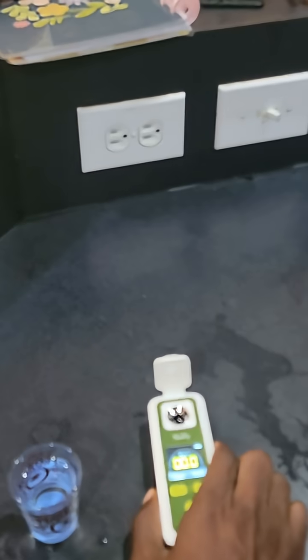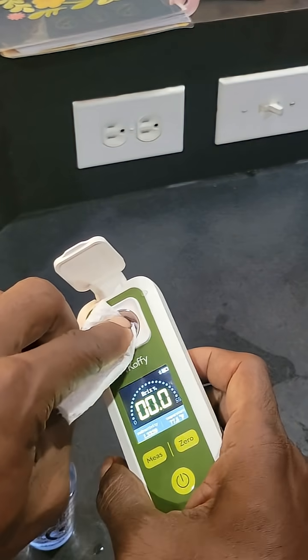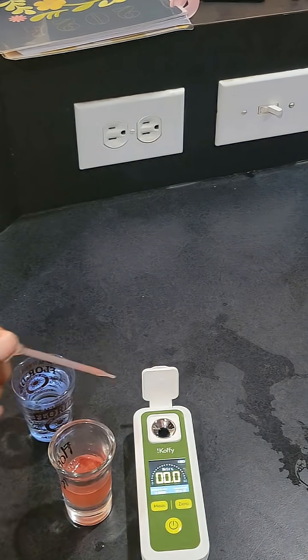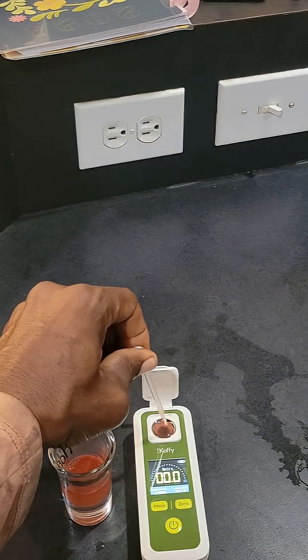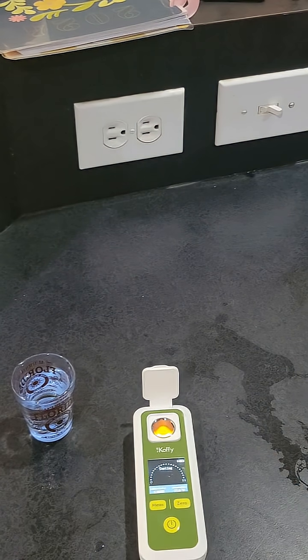Step five: empty the water and make sure you take a paper towel or tissue and dry it out. Step six: add your sample — watermelon in this case. Step seven: press the measure button and wait to see the result.